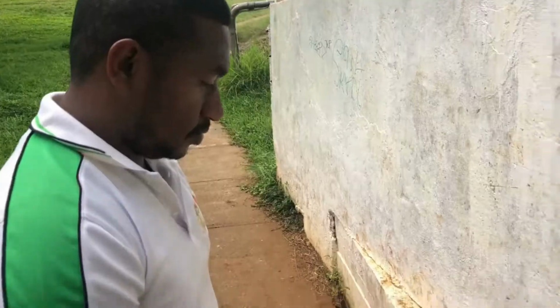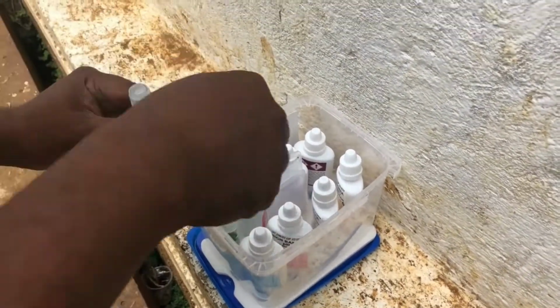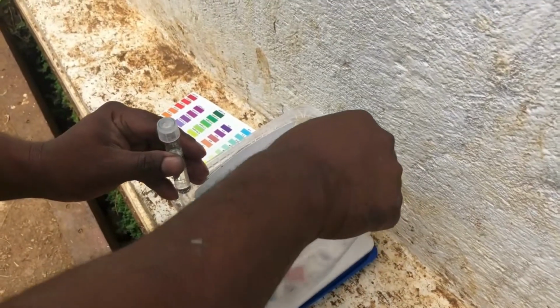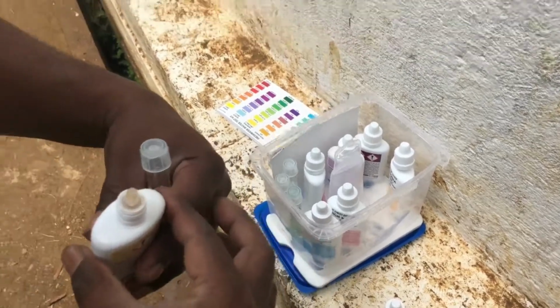Test 2, ammonia. Ammonia comes from fish urine, solid waste and leftover food. Ammonia is really toxic for fish. Put 8 drops of ammonia test solution 1.